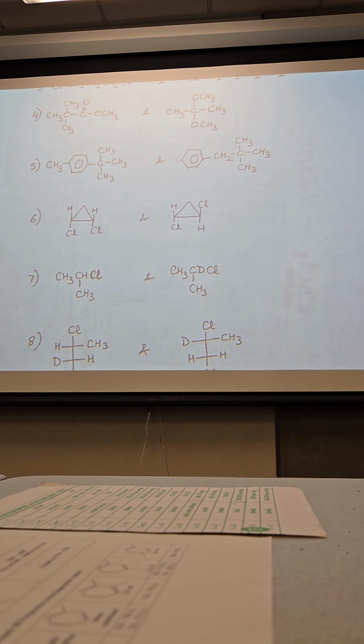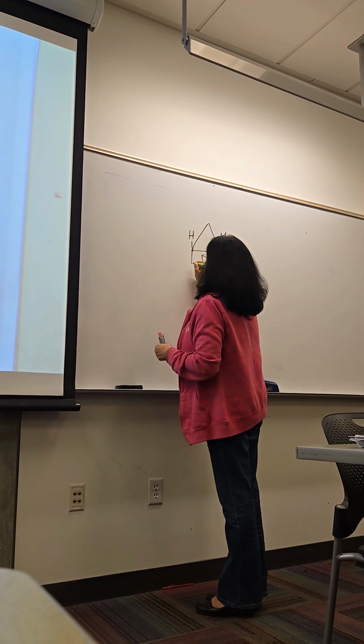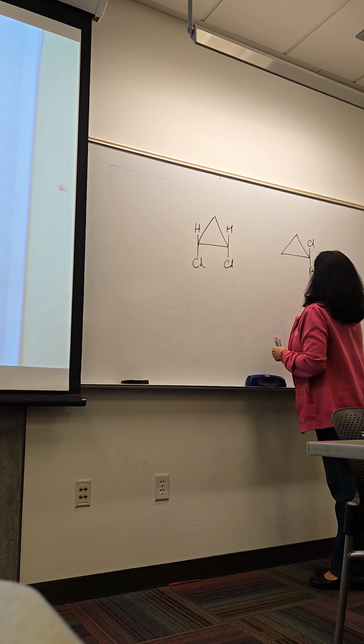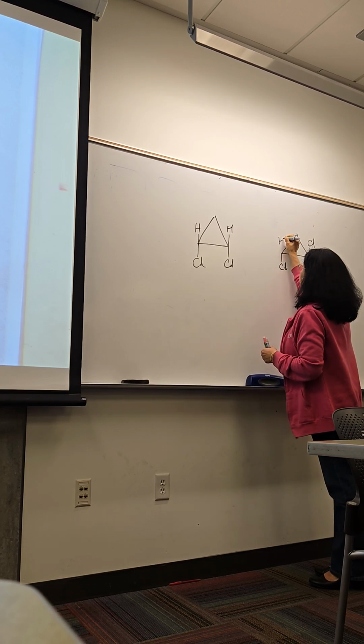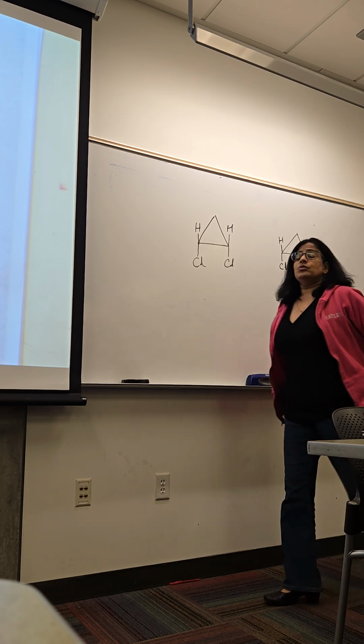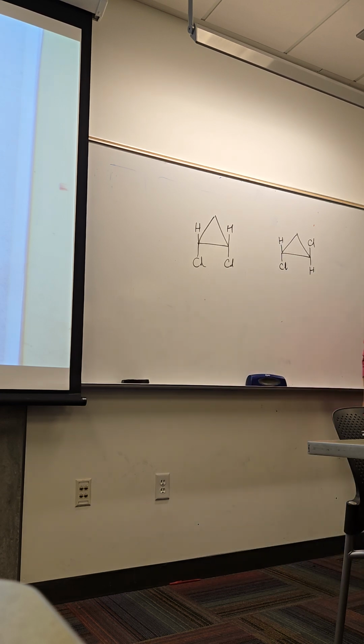Okay, so how do we use proton NMR to differentiate between the cis and the trans? Anybody? How many proton signals can we expect for this one? Two? Are you sure? I was thinking 1 signal. Not 1, but not 2. What about 3? Yeah?